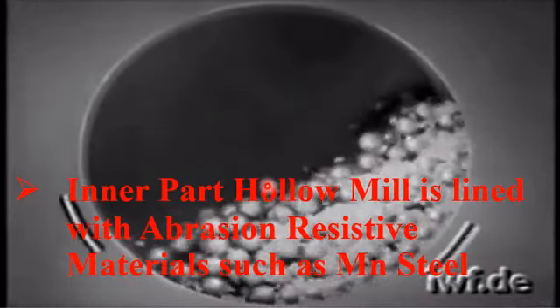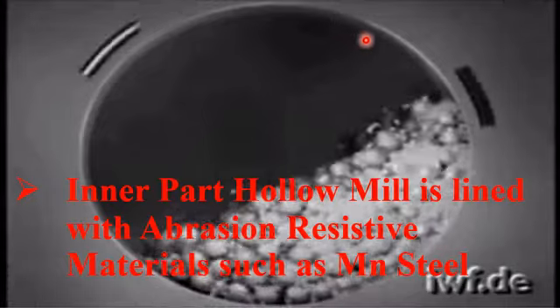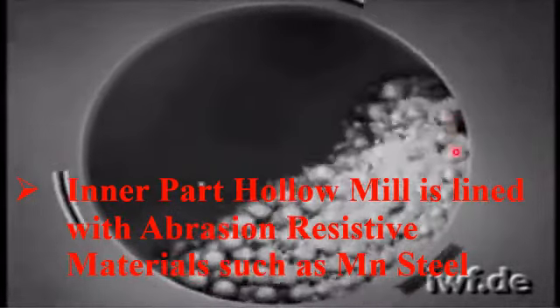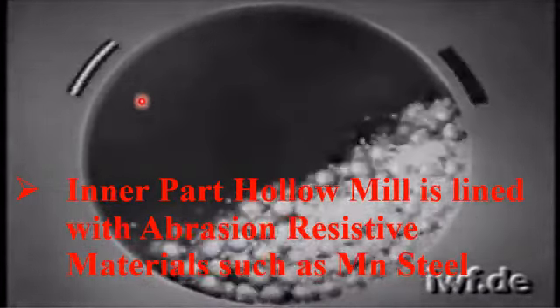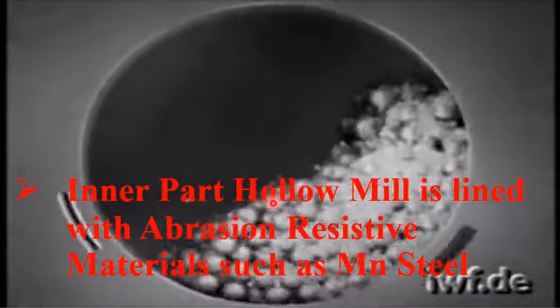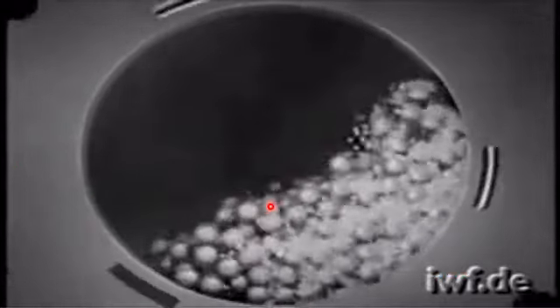basically convert the material into very fine nanoparticles, but the internal hollow part, which is this part, has a different material structure. It consists of a different material, and this material may cause an impurity in the crushed bulk material turning into a nanoparticle.